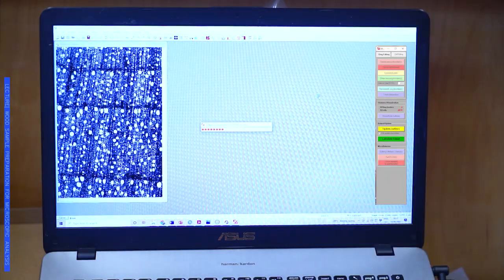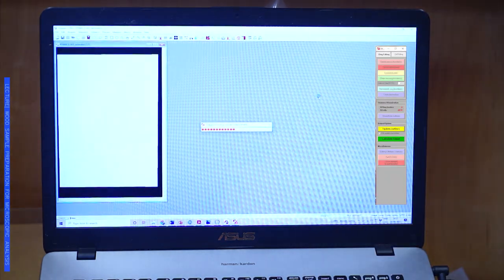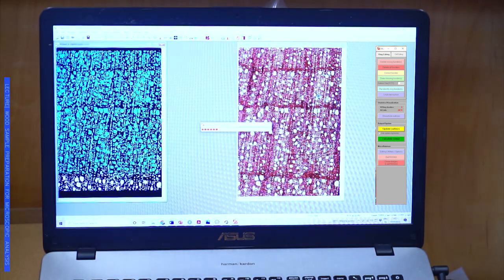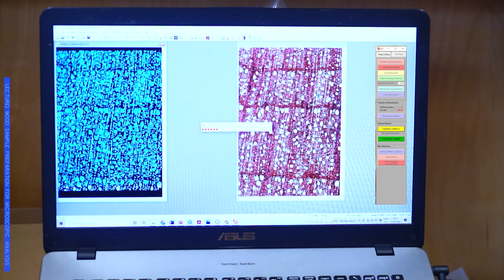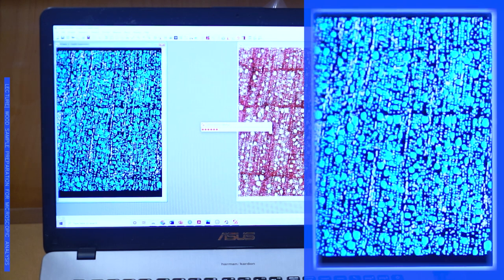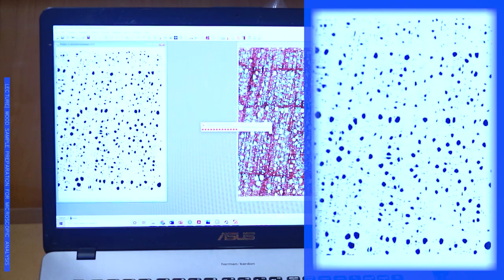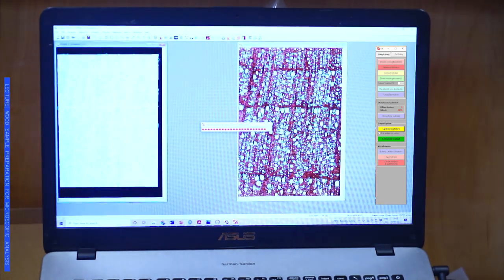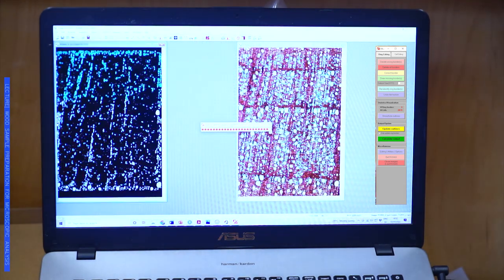The program will start going through a lot of different filters. It will start analyzing the whole image, taking out shadows and some cells that are not perfect. In this case, I'm using a very small image because it will take a long time. Normally with the images that we are producing, it can take over 40 minutes, but that's because we are measuring millions of cells. Here we are just measuring probably 500 cells or something like that.